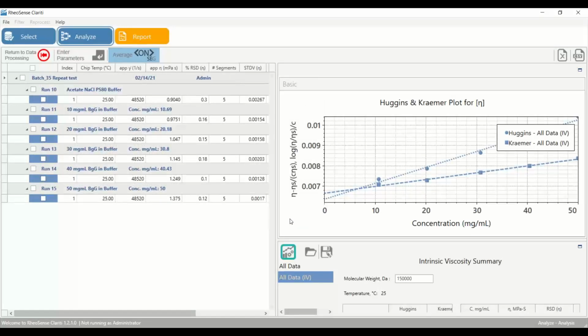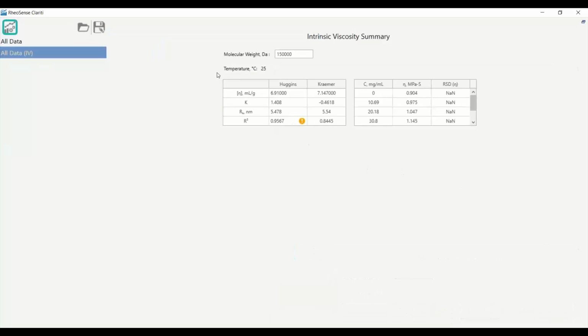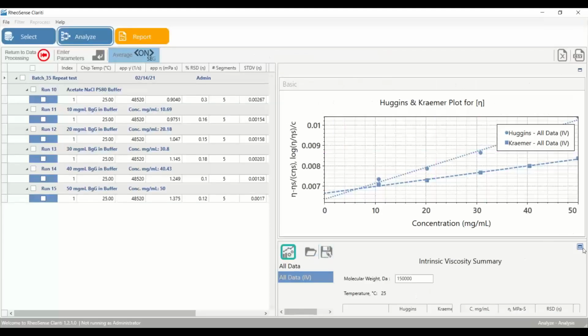So now I did that, and you may have seen the charts shift a little bit, which is good. You can then go down, and that was supposed to change. So let's try again.